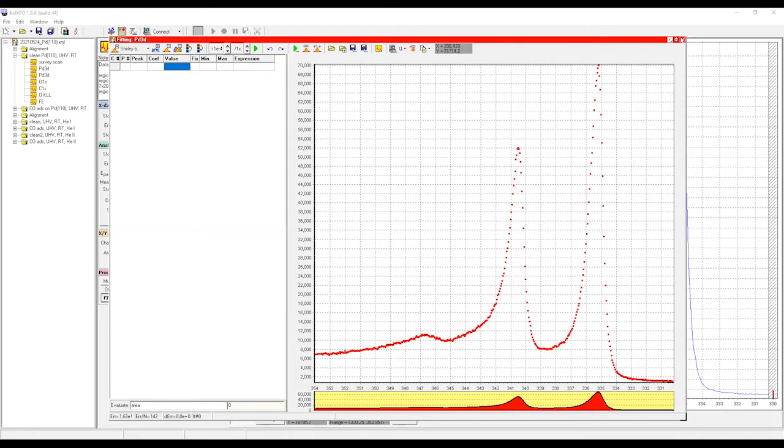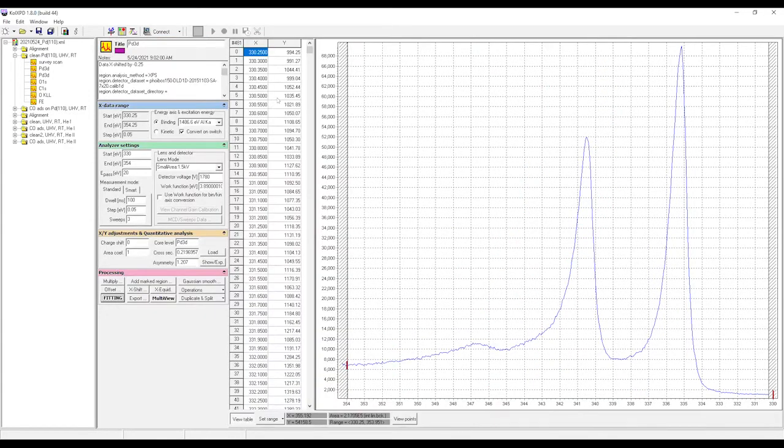In this software, actually, this software was developed not only for fitting XPS spectra, I mean for finding the states which actually contribute to the spectrum, but also for operating some analyzers and manipulators. This guy was quite good at programming, so he tried to build something so that we can use this software in the same way as Prodigy.